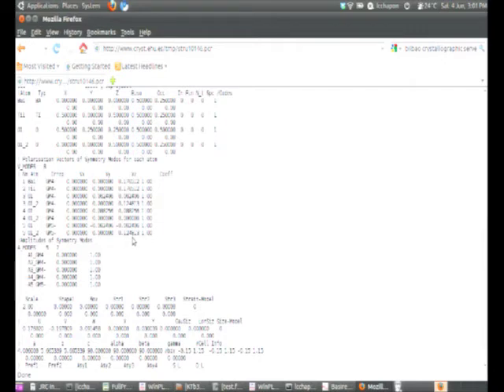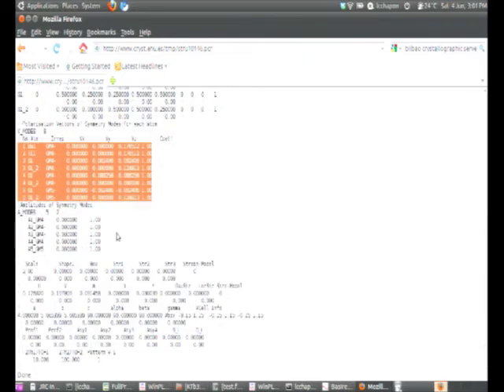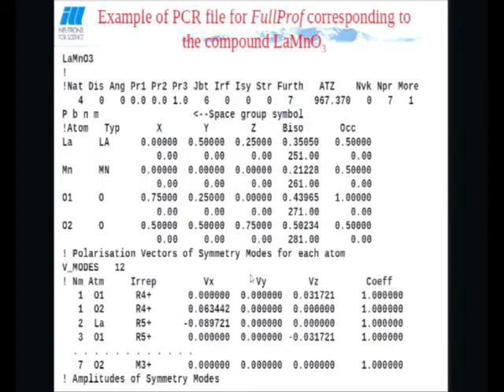And if you have a lot of data sets with a structural transition that is continuous at the transition, and you refine these modes, you will see very nicely not only the primary modes of the phase transition, but also the secondary modes that are starting to come in at lower temperature and so on. And I believe this is a very intuitive way to do it for the people that use symmetry, but also a very good idea to do that in a more systematic way.